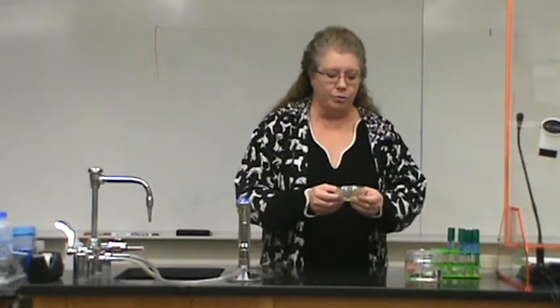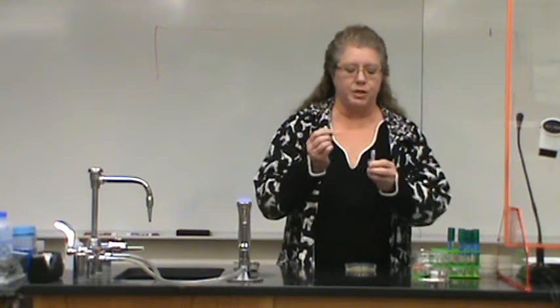You will let that set for just a minute or 2, just so that the bacteria soaks into the agar. In the meantime, we have started our Bunsen burner. We have a canister of alcohol. Do not get the flame and the alcohol close together. We know what happens. It's not good. And you have a pair of forceps. These cartridges in your handout, I think it shows this little handle on this specialized one. We don't have those. So we use tweezers, forceps to get the discs out. What you're going to have to do for each of the discs when we get ready to do it is push on one side of the disc to be able to grab the other side.